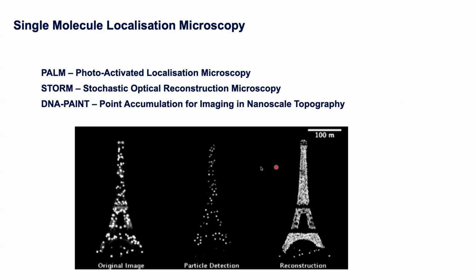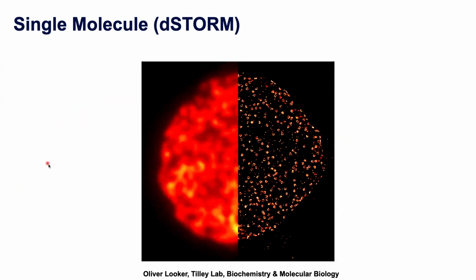The nice thing here is that Gaussian fit that we're getting from the raw data can produce up to a 10-fold increase in resolution. So again, this is another malaria parasite imaged in wide field mode on the left, and then D-STORM imaging on the right-hand side.